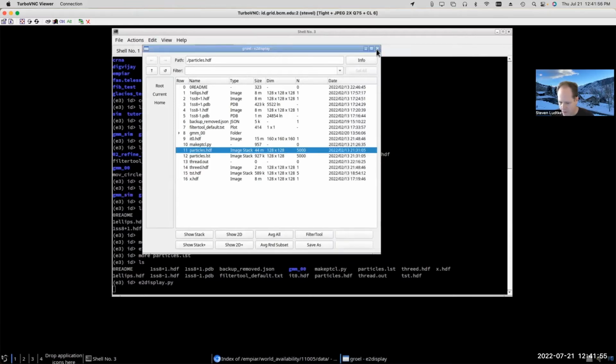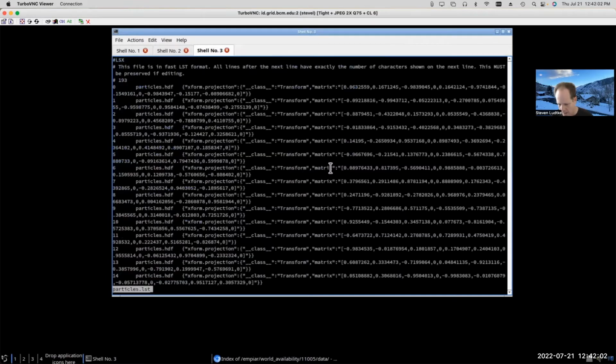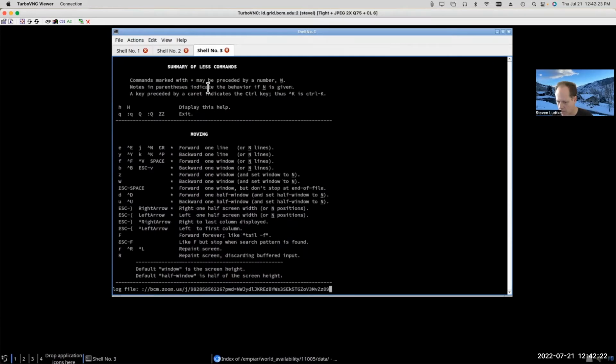So this LST format allows us to reference the image data in one of these files and also reference the header data in those files. But then any information that you provide here can override the information that exists in the header.